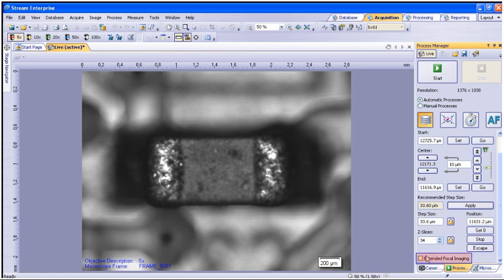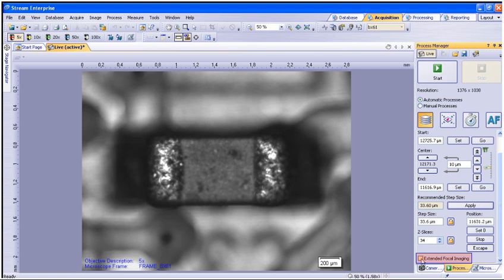You will need to make sure to check mark extended focal imaging at the bottom of the process manager window. This will allow the software to automatically generate the EFI or all-in-focus image once it's done scanning the Z steps.